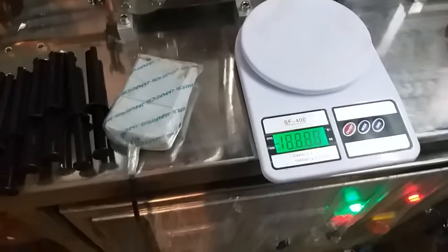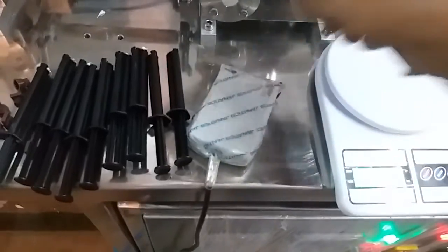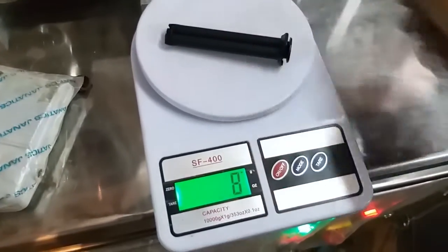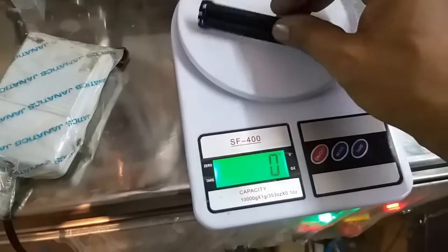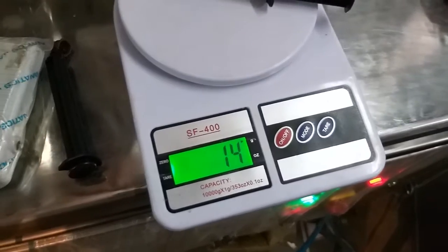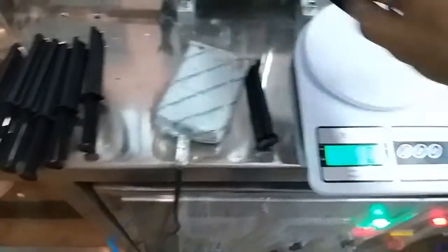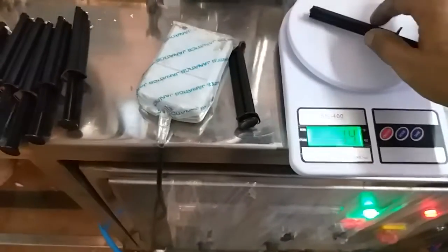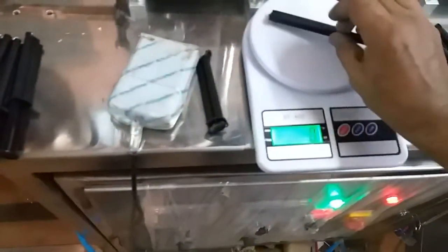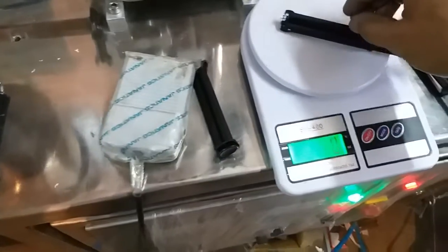Now I am turning on the weighing machine to check the empty cartridge weight. The empty cartridge is around 9 grams. Now we are checking the filled cartridge — it is showing 14 grams. Again, 14 grams. So the accuracy of filling is very high from this machine, confirming a fill of approximately 5 grams of product.